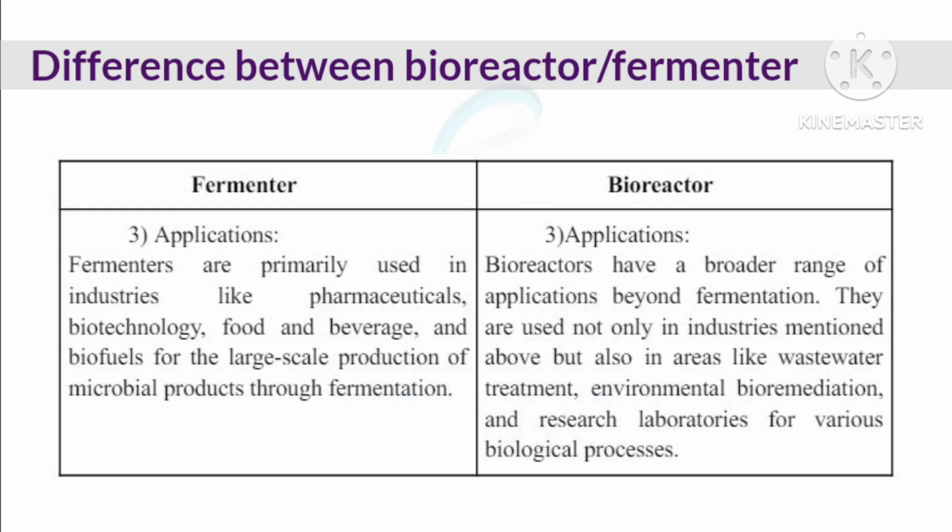Then application. Fermenters are primarily used in industries like pharmaceuticals, biotechnology, food and beverages, and biofuels for the large scale production of microbial products through fermentation. Whereas bioreactors have a broader range of applications beyond fermentation. They are used not only in the industries mentioned, but also in areas like wastewater treatment, environmental bioremediation, and research laboratories for various biological processes.